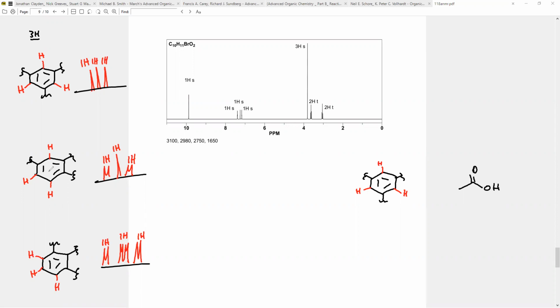So again, don't try to memorize these. Look at my logic for them and how I'm coming to the conclusion that these things would look like. Because I can't guess what's going to be on your quiz or on your exam, but I can tell you ways to make good guesses so that whatever you get on your exam, you'll get it totally correct, because you have great fundamentals. And you're learning from me, so you're going to have great fundamentals. Okay, cool. So these are my 3 different 3H arrangements.